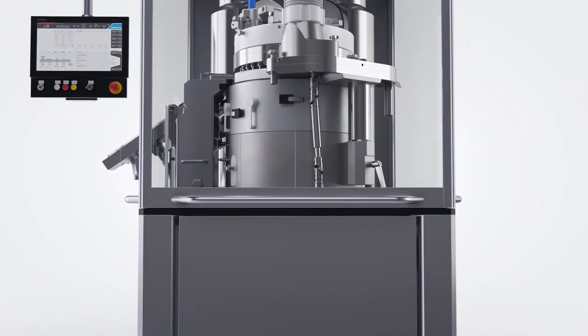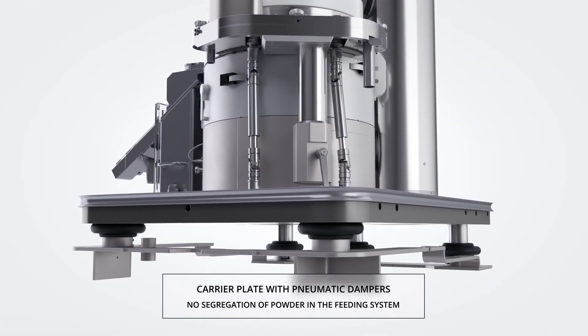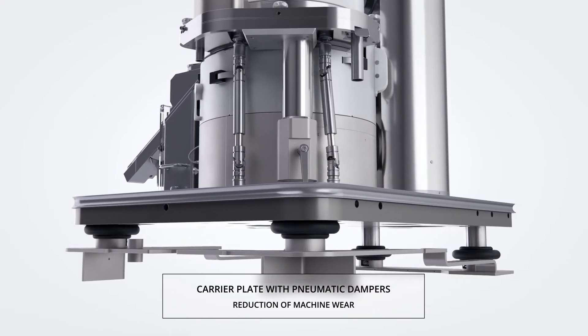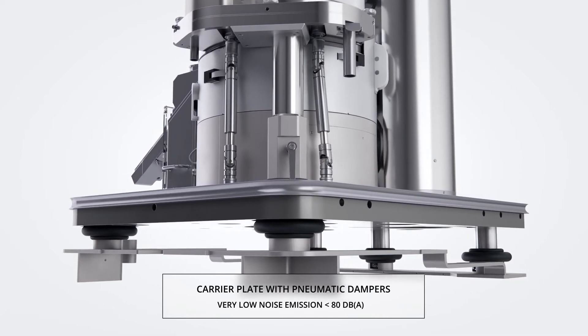The carrier plate that supports the pre-compression and main compression columns is mounted on pneumatic dampers. This unique and patented design fully isolates vibration from the headpiece and machine base. The result is an extreme reduction in operating noise level.